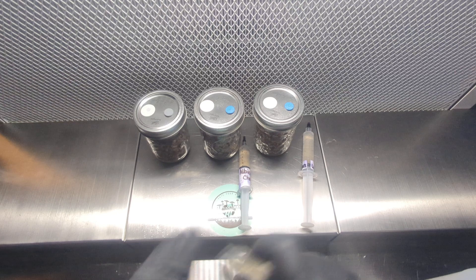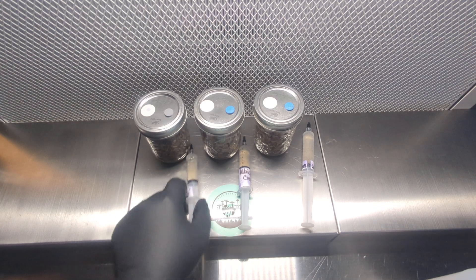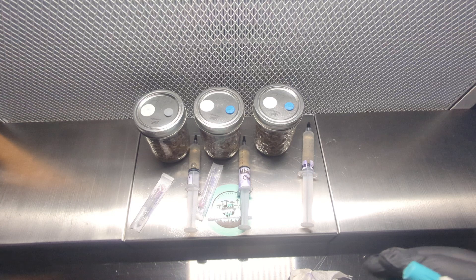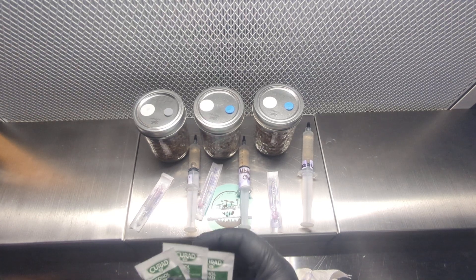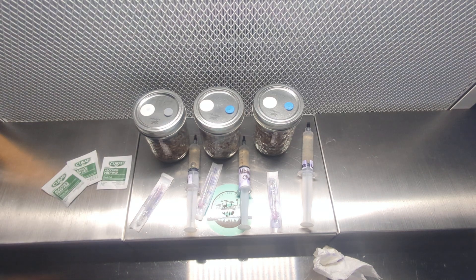I'm not sure how the audio is going to pick up since I'm in front of the flow hood and I'm just using my phone to take video — no special microphone — but hopefully it turns out good enough. If not, you have the visual aspect of it. These are the needle packages; I'm giving them a quick spray and wiping them down. I'm going to use the alcohol prep pads — typically I don't use these, but for demonstration purposes I'll go ahead and show you how to use them.